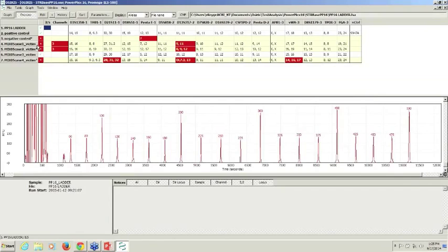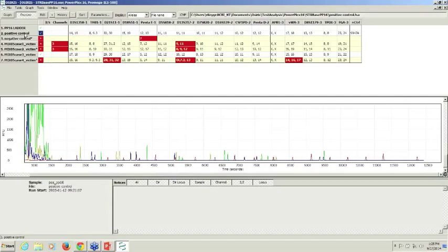And you'll see that there is the standard colors set up here. So what we're going to look at is, first of all, you can navigate by clicking any of these cells. You'll see that the white cells and the samples, like the positive control here, has passed because it has the green checkbox. Some of these others have not passed because there are red X's.